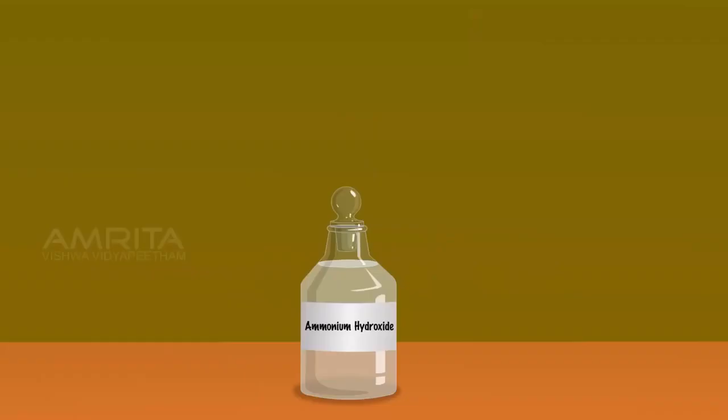Take ammonium hydroxide using the dropper. Take the test tube containing yellow precipitate of silver iodide. Add excess of ammonium hydroxide into the silver iodide precipitate and shake the test tube well. Silver iodide is insoluble in ammonium hydroxide solution.